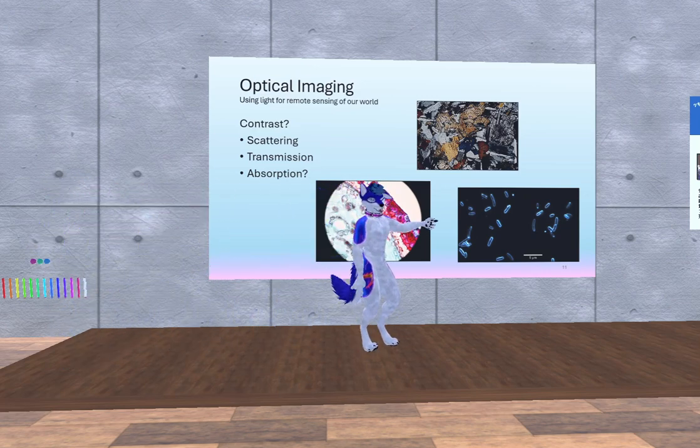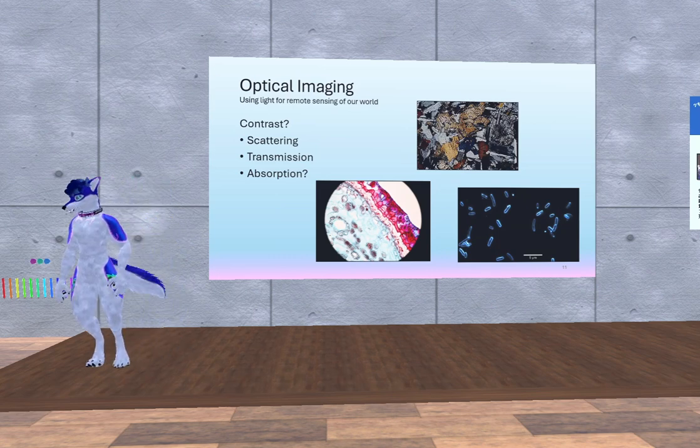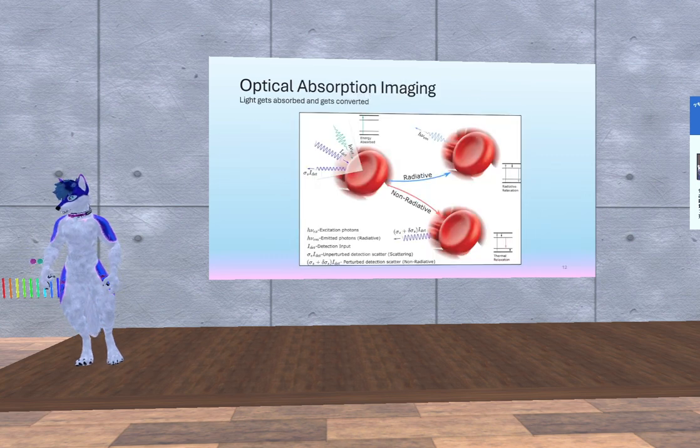Anything that fluoresces, you've probably seen fluorescent microscopes, 2-photon, second harmonic. These all rely at least partly on absorption properties, so it's not commonly considered that way. But that's not quite what we're talking about. So when we're talking about absorption microscopy, we're not talking about this.